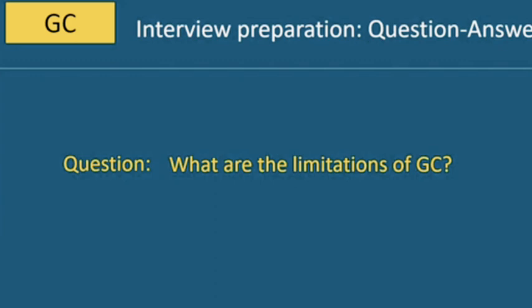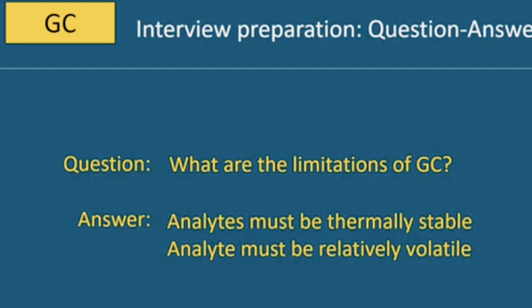Next question. What are the limitations of gas chromatography? So limitations are: analytes must be thermally stable and analyte must be relatively volatile.